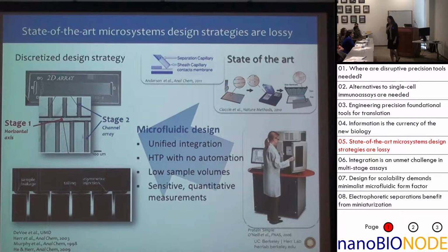Essentially, I will say this, and I am a microfluidicist, so I'll be disparaging myself, but they're highly functionalized glass microscope slides is basically what they are, right? So they're pieces of glass that have these microchannel networks etched into them, and then a top plate is sandwiched on, for example. There's other ways to do it. And you have these little enclosed microchannels that can route and manipulate fluids and do separations to make measurements. All of the microchannels I'm going to show you today, well, most of them, are about the diameter of a human hair. So when you think about the microfluidic channels, think about a human hair being that channel, right? And that's what you're looking at here. You have a network of channels that are about the size of a human hair. There's also an intersecting channel right here.